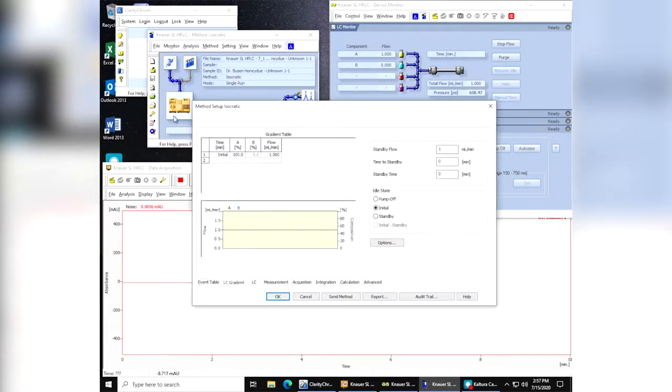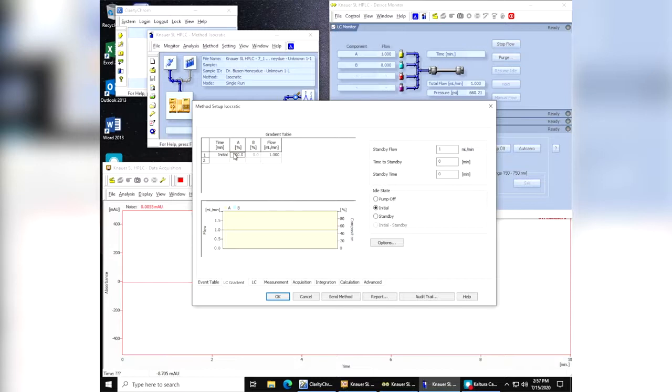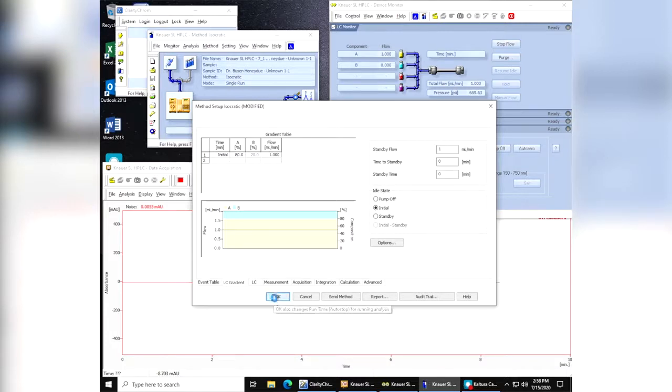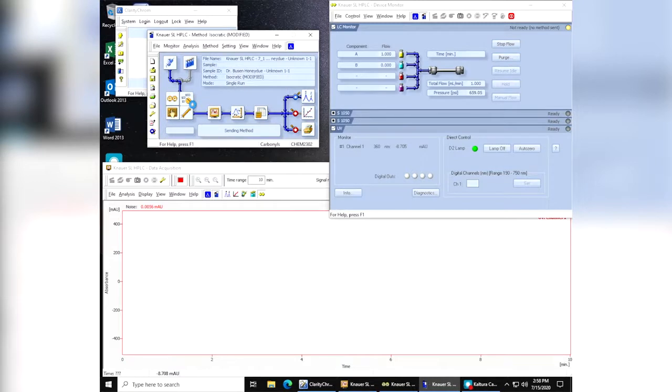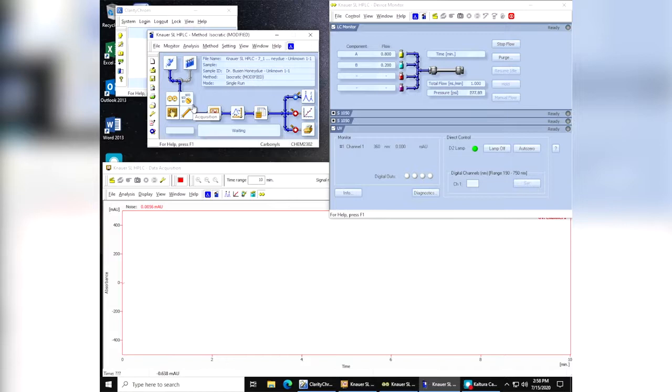In this particular case we're going to go into the method setup for isocratic and all we're going to do is we're going to change this 100 to 80%, which will change automatically. Once that's done we can click OK. Then we want to say yes, we want to send the method to the instrument. The instrument will change its settings here, so it's now running 80-20.